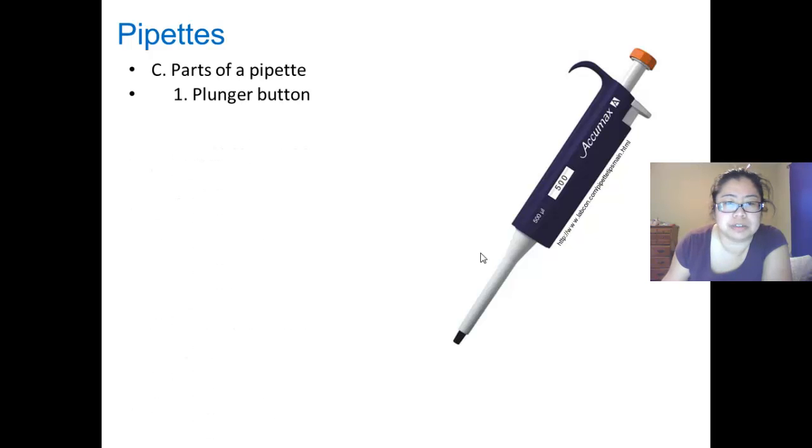Parts of a pipette. First is the plunger button. The plunger button is used to withdraw and aliquot amounts of liquid.